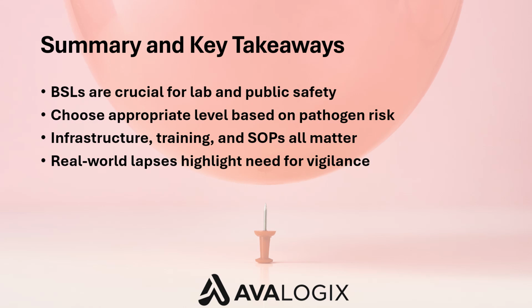First, biosafety is the foundation of safe and effective work in microbiology. It's not optional, and it's not just paperwork. There are 4 biosafety levels, each matched to a certain risk profile of the organisms handled. These levels influence everything: how the lab is built, what equipment you use, what procedures you follow, and how you behave. BSL 1 is minimal risk, while BSL 4 involves high-stakes, high-containment work.